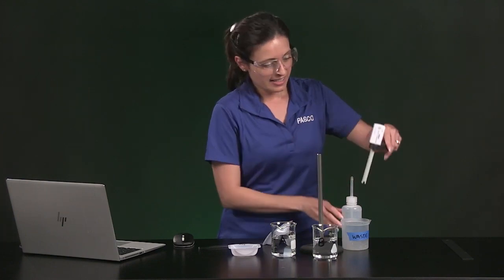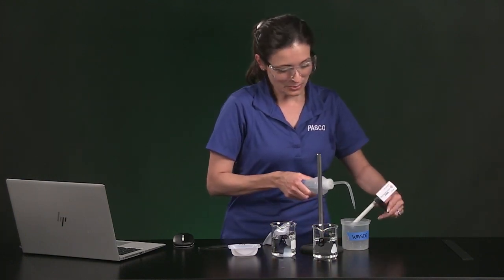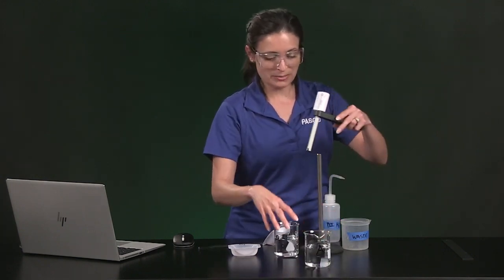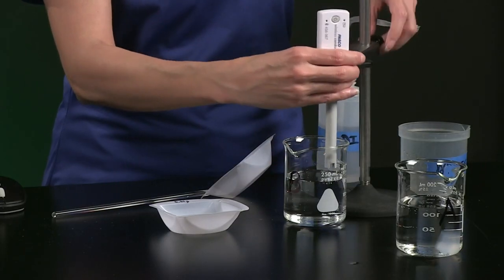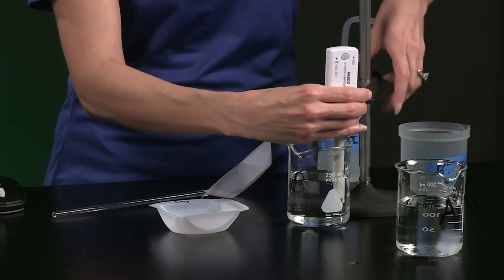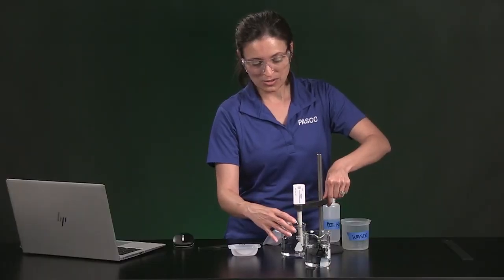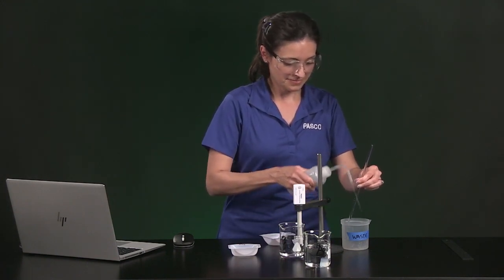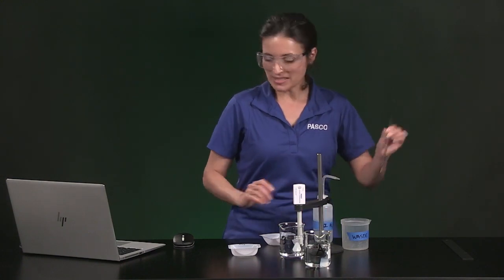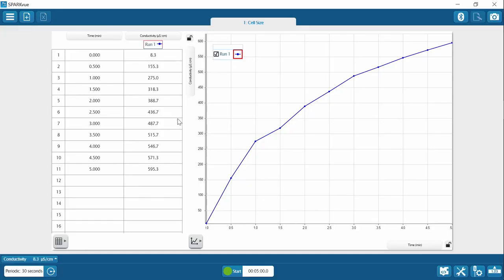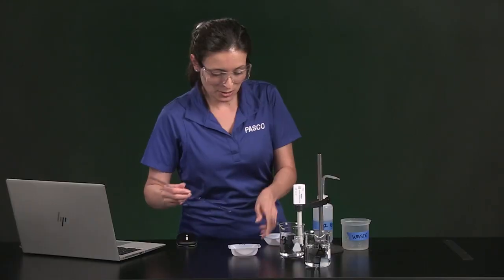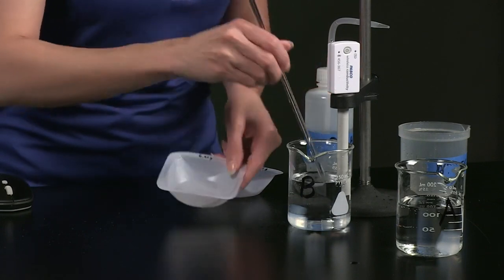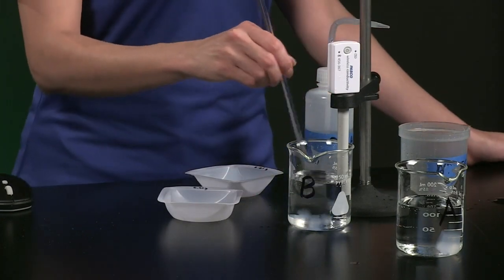So I have to clean the conductivity sensor with some distilled water. I'm going to switch to a new beaker of 150 milliliters of distilled water. I need to rinse my stirring rod with distilled water. I'm going to start collecting data and put the cubes in. All eight cubes and we'll fast forward through data collection for you.